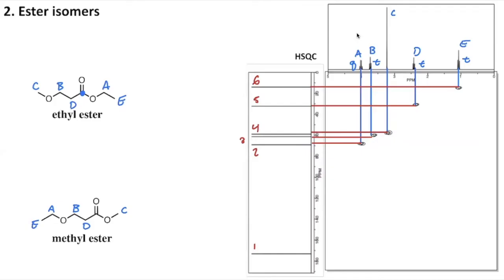So you see why it can be really important to either work on paper with a straight edge or use some kind of straight edge tool in something like PowerPoint or Google Slides to make sure that you're getting these as straight on as possible. And even this is by far not perfect. So we'll work with it and use it to identify our cross peaks so that we can label our structure. Just going along, I'm going to put down the correlations that I'm reading from my not so perfect lines to tell us what these signals correspond to.